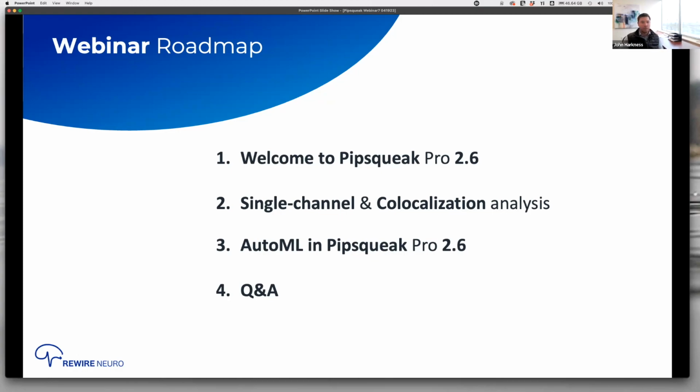I'll talk about how to do some more powerful types of analysis like batch processing of images. And then probably most importantly, I'm going to spend a little time talking about how to train a custom AI model in Pipsqueak so that its detection capabilities are really fine-tuned for your images. So again, feel free to ask questions anytime. Otherwise, I'll stop at the end for some Q&A before we hang up.